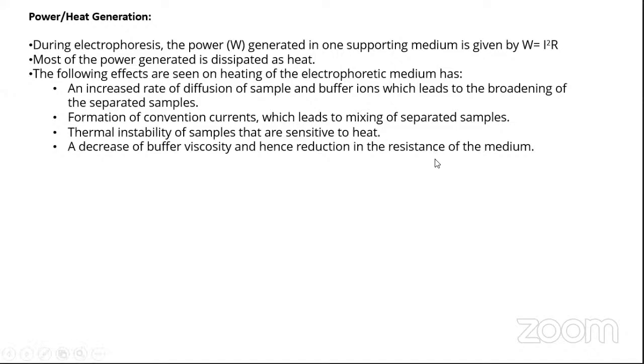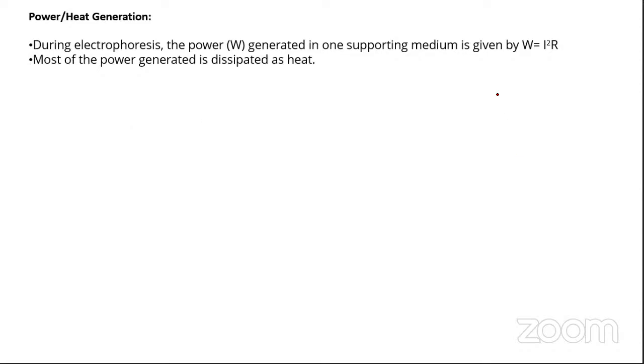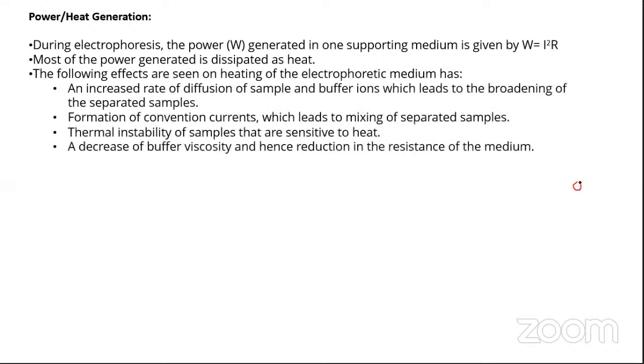Okay. If you want me to give you another perspective, let me take this chance now. Just a moment. Okay. So now just imagine this situation. That this is the size of buffer ions for you. This is a buffer ion with a charge. I will give it a charge as well. So compare this as a positively charged buffer ion. Okay. And this is your sample molecule. It also has a charge.